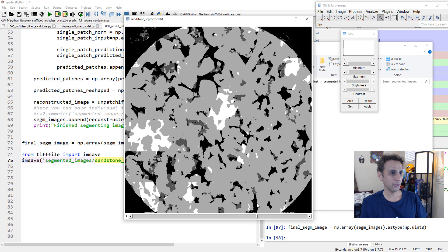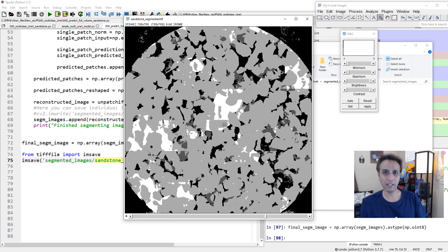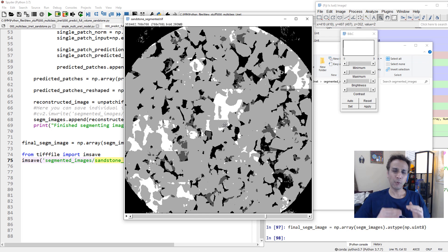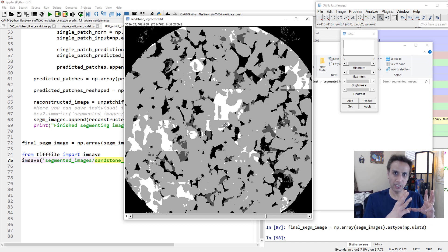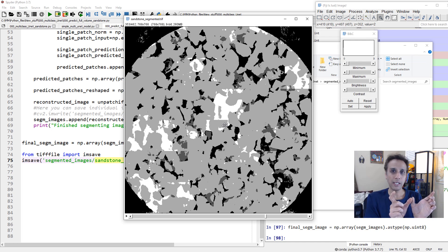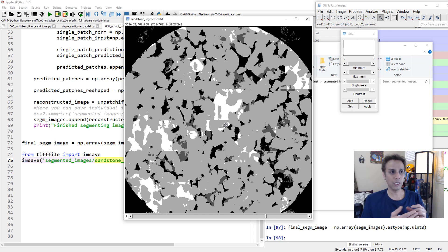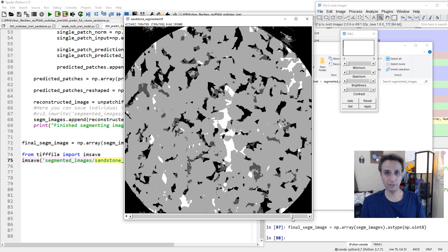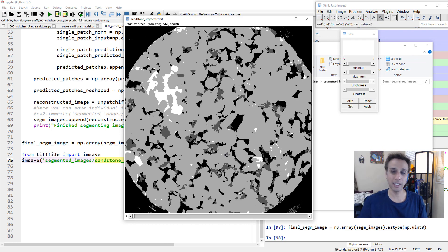One thing to notice is a hard cutoff artifact visible in some images. This happens because when we do 128 by 128 non-overlapping patches and segment each one, we lose some context at the boundaries. You need to look at how to divide images into overlapping patches and decide how to handle the segmentation in the overlap region - either take an average or use smooth blending. This is a known challenge when doing this type of patching.